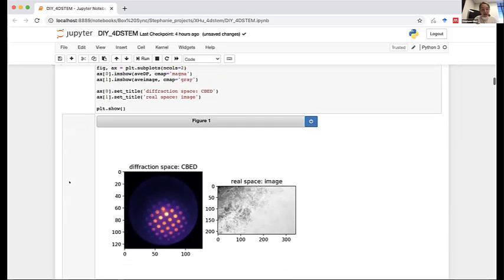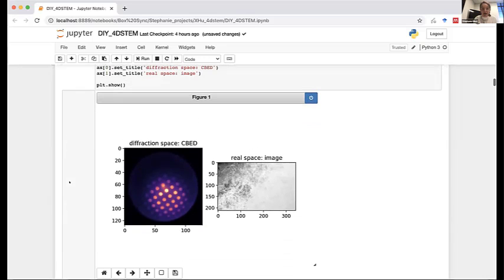So this is the end of the first section where we're just talking about loading the data and getting a basic overview of what's going on. And we've used some basic tools in NumPy and Matplotlib to be able to start taking a look at our data in a Jupyter notebook. And Roberto, I'll pause to see if there's anything you want to add.